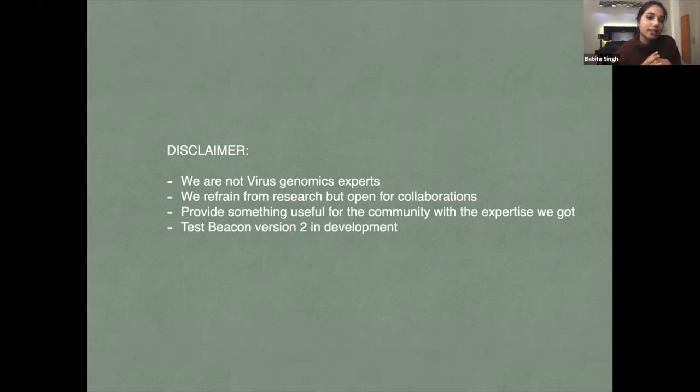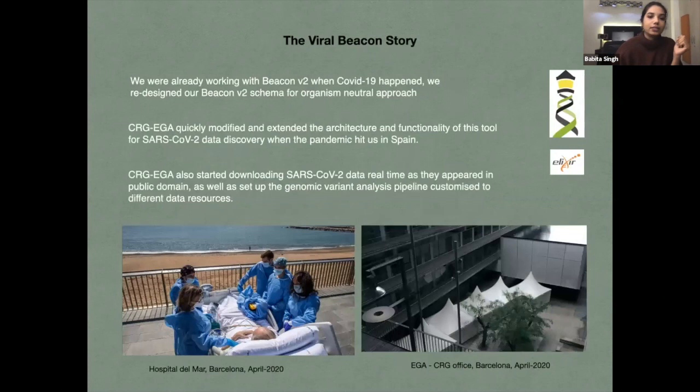And last but not the least, we wanted to test this Beacon version 2, and the data was already there for SARS, so for SARS-CoV-2, and then it kind of fit in. And this also happened. The image that you see on your left is where our institute is, PRBB, where we are based.